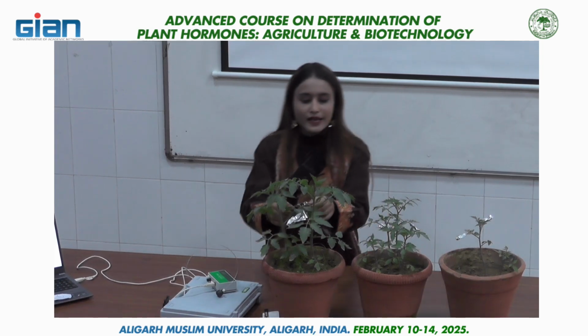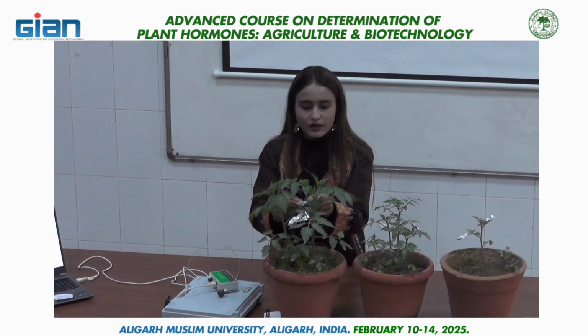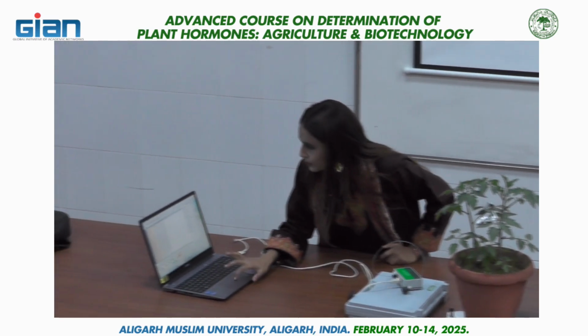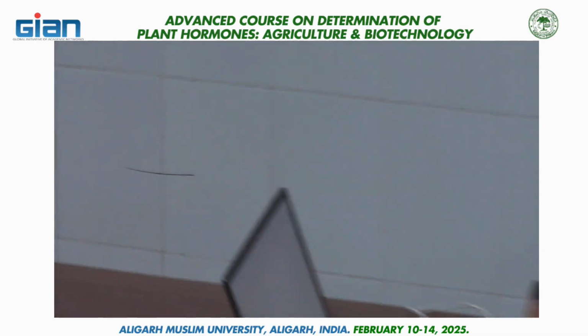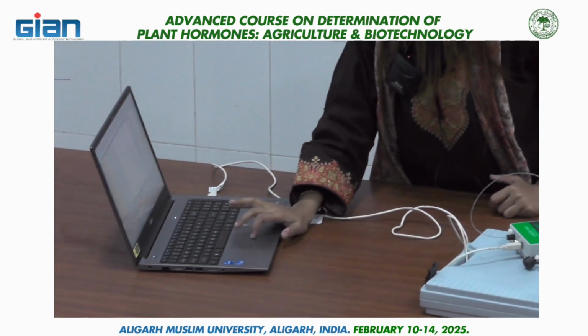Okay, so how to take its reading? Firstly, in this laptop, let me show you. Yeah, these are tomato plants.